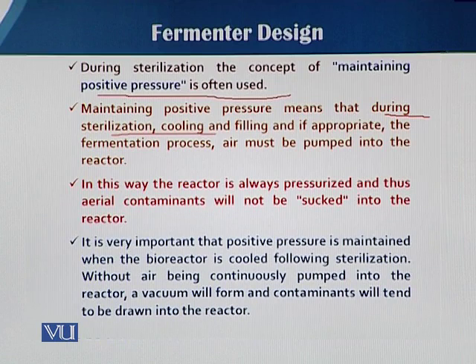In this way, the reactor is always pressurized, and thus aerial contaminants will not be sucked into the reactor. Because when there is a negative pressure, there is a chance of contaminants being sucked inside the fermenter. So it is very important that positive pressure is maintained when the bioreactor is cooled following sterilization.